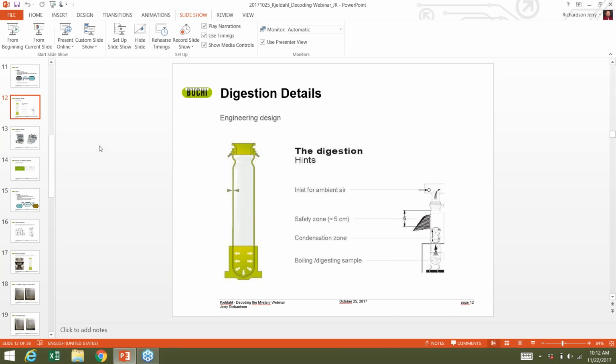And then, of course, is the taper design. The taper at the top, that flare, that kind of pinches, and then you have the flare at the top for the connection, very specifically to increase the security of the connection between the sample tube and that of the distillation unit, to make sure that all of the ammonia is going forward to the condenser so it's captured. Okay, I hope that answers your question on that. The quality of the glass is actually very important.